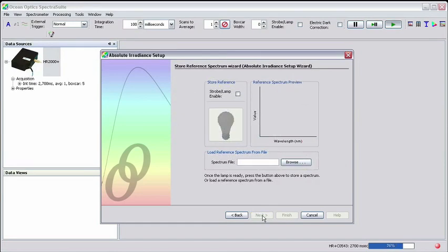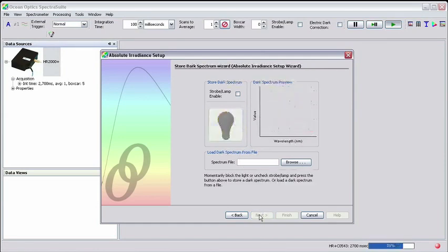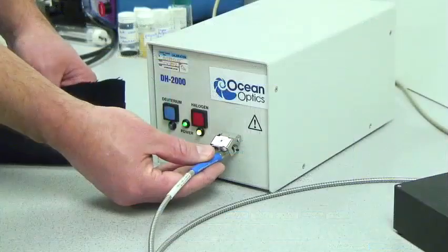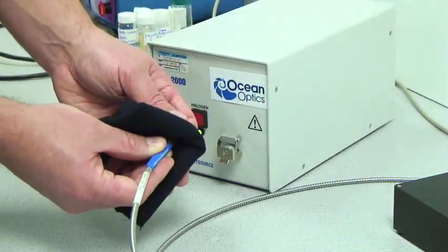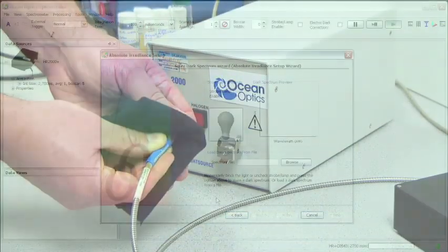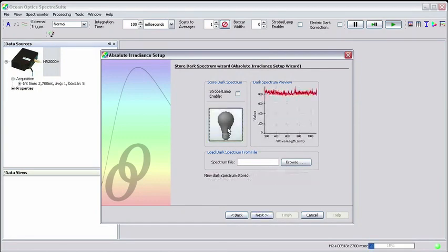In the next window, click the yellow lightbulb button to store the reference spectrum and then click Next. Now, you'll need to block the path of the light source or close the shutter. Click the gray lightbulb button to store the dark spectrum and then click Next.